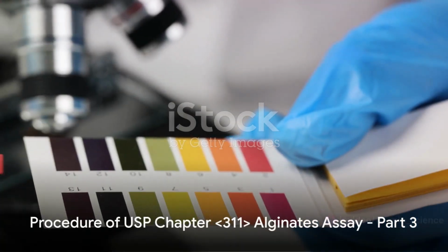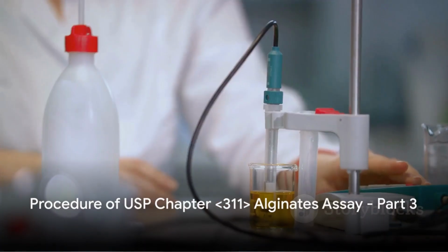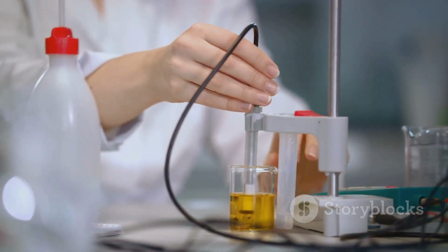The beauty of the USP chapter <311> Alginates Assay is its simplicity and precision. The procedure is not overly complicated, yet it provides us with reliable and accurate results. And that's what we're after in the world of pharmacology: accuracy and reliability. With the testing complete, we now move on to the final stage of the assay. The final stage of the assay procedure involves interpretation and reporting, so let's dive in.